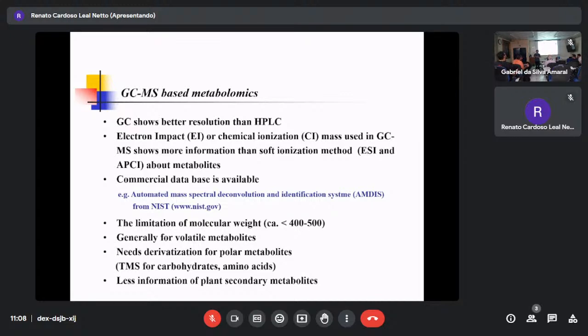But even though we detect the molecular ion a little better, it's not good enough. When you purchase a GC-MS, both EI and CI are possible, but 99% of people use EI. Our aim in wanting CI is to see the molecular ion, but fragmentation is less. We cannot use the database, and the fragmentation is not very reproducible. CI is not much used except in a few cases.